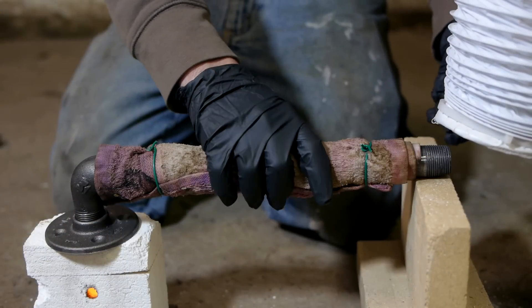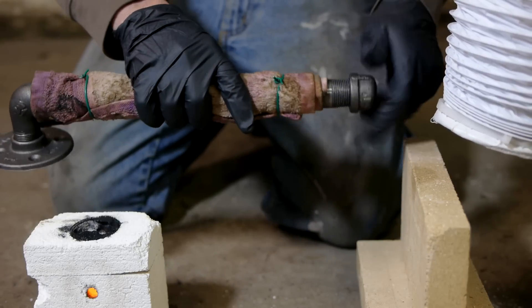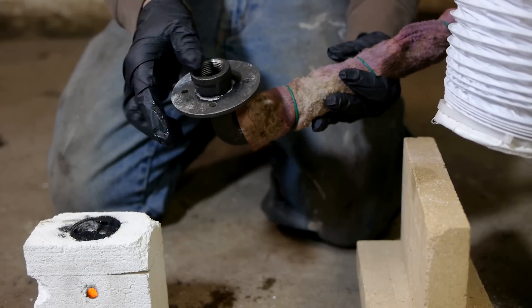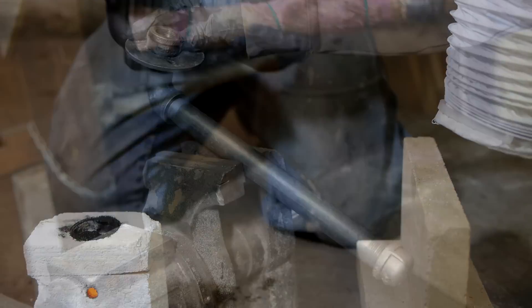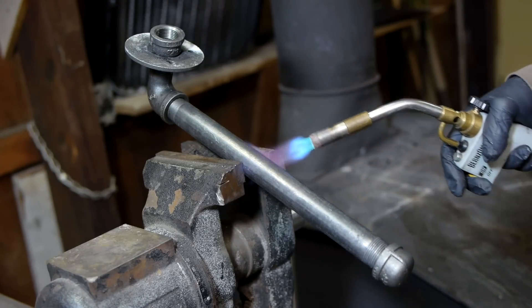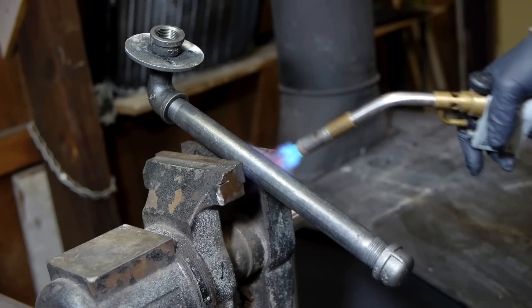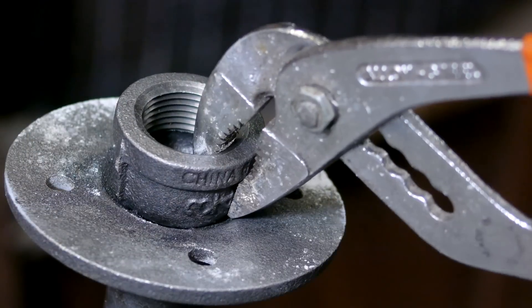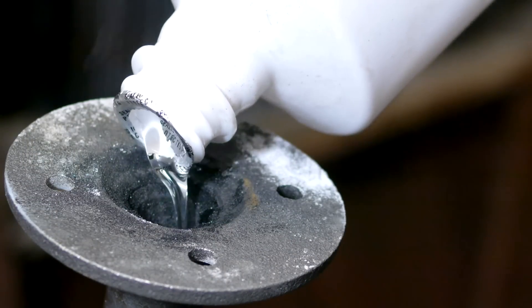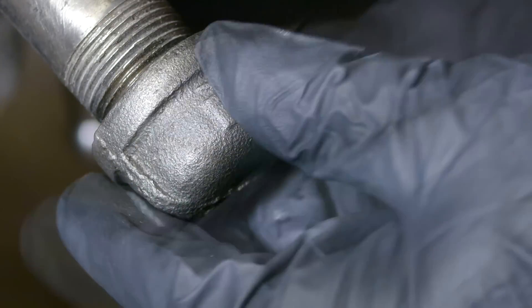Once it seemed like the reaction had completed, I removed my pipe and capped one end to prevent oxygen from getting inside. On the other side, I set a cap upside down over the opening to also protect from oxygen, but at the same time allow gas inside the pipe to vent if it's still being pressurized. My plan was to mount the pipe in my vice at an angle and then heat it with my torch so that any potassium lining the sides would re-melt and run down into the end cap. As it was cooling, I poured some mineral oil in from the far end to protect any potassium metal that collected in the end cap.